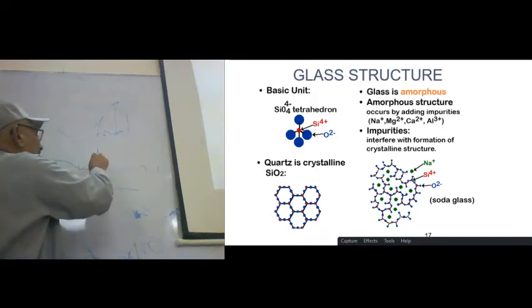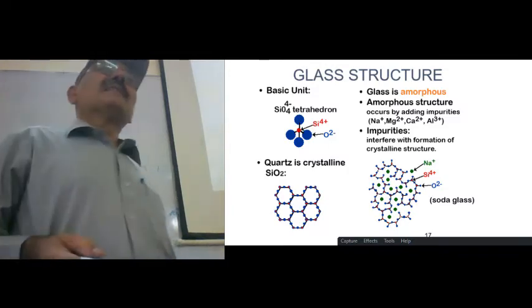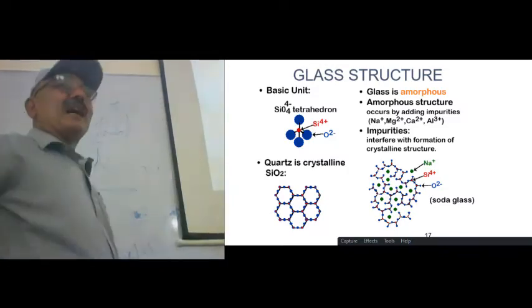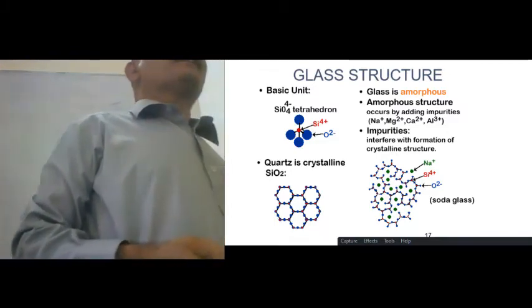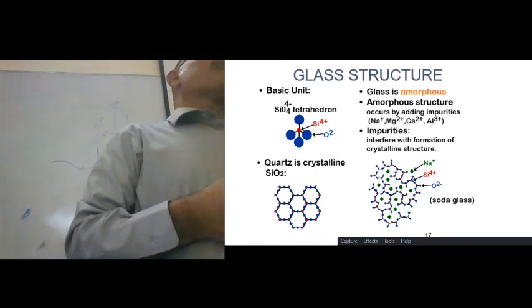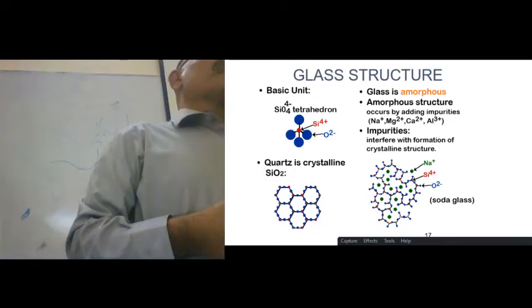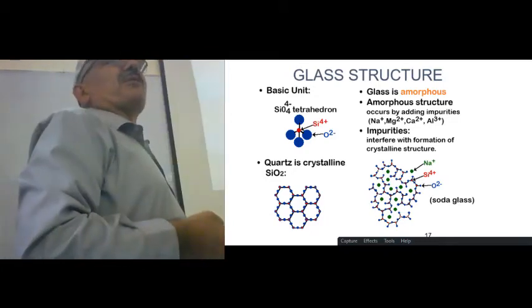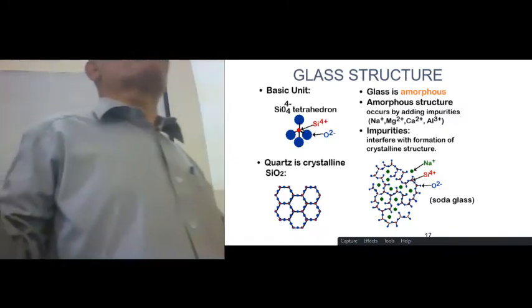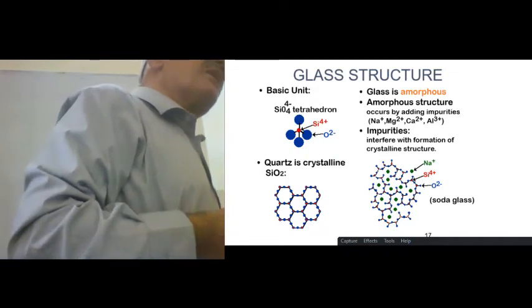So, I am talking about the same small peak of the differential thermal analysis, this small plot, in which you put 5 to 10 milligrams of the reference material and 5 to 10 milligrams of the material under test, and you heat it from room temperature to say 1200 degrees centigrade, and you can write a book upon it. There is so much information in this small plot.